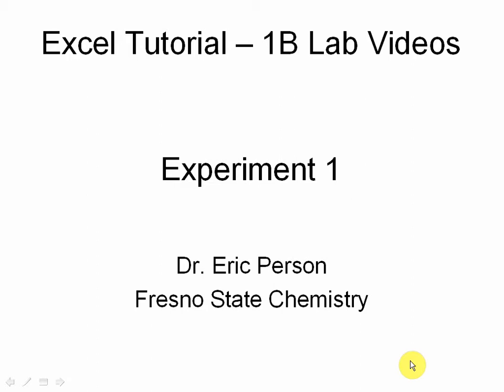Hello, in this Excel tutorial video, we'll be going over the calibration curve from Experiment 1 in the Chem 1B lab manual.